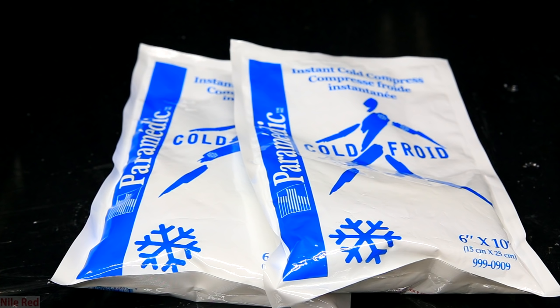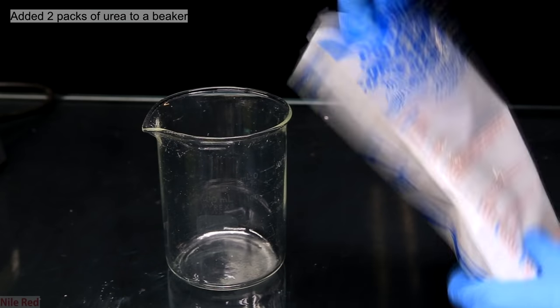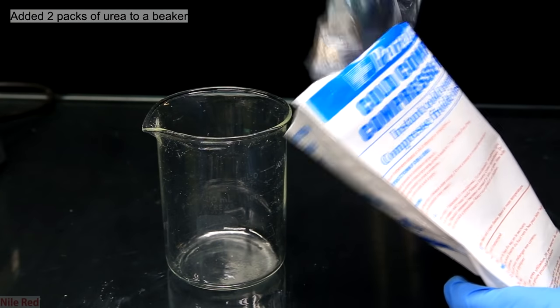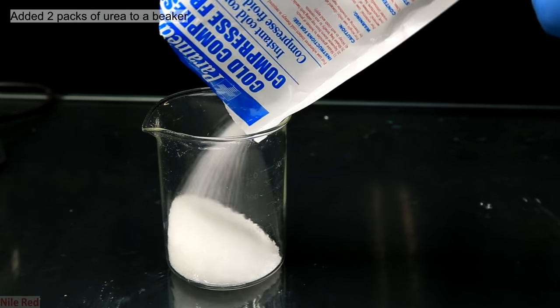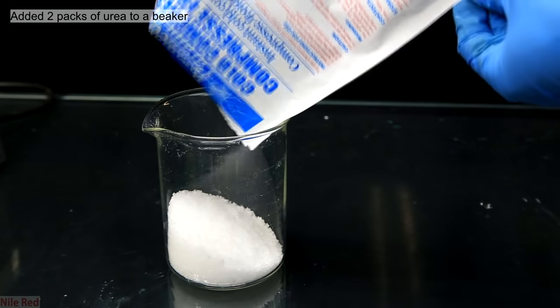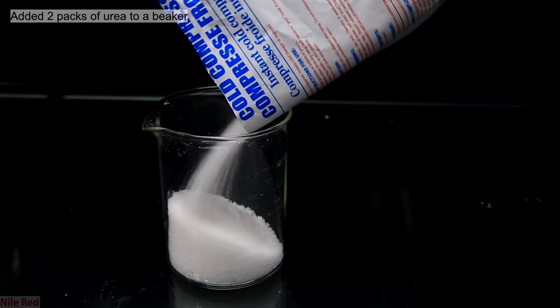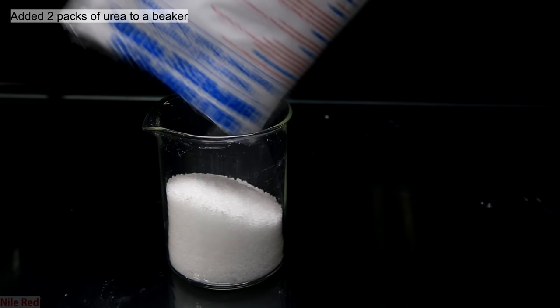For this video, I'll be recrystallizing urea that I got from two instant cold packs. In America, these are very common and easy to find. Some cold packs though do use things like ammonium nitrate, so always be sure to read the ingredients. Like ammonium nitrate, urea is used because when it dissolves into water, it cools down. I start out by pouring the contents of two cold packs into a beaker. To do this, the cold packs cut open and a small bag containing water is removed and then everything else is poured into the beaker.